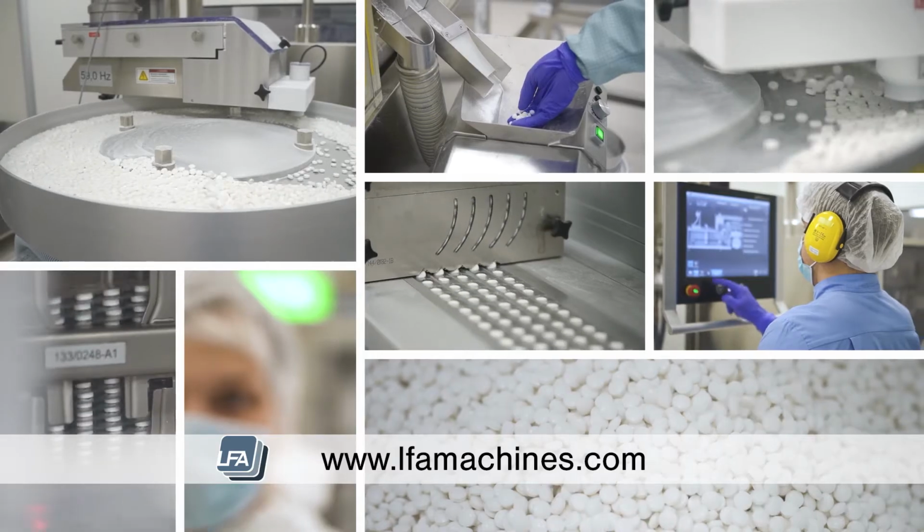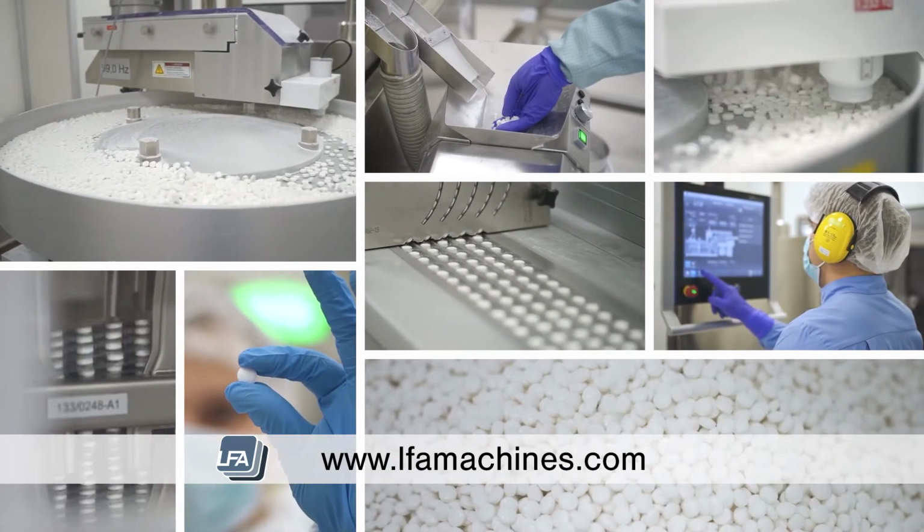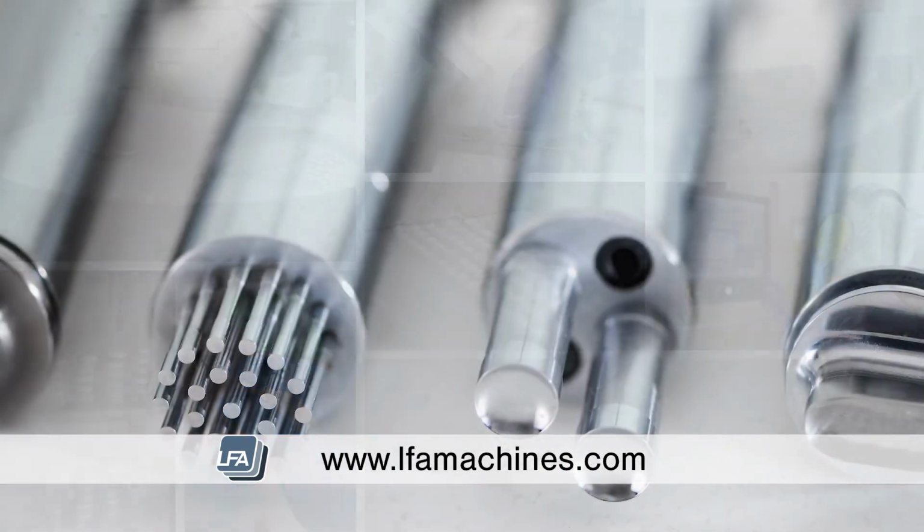It should be mentioned that tableting can be costly. Whilst it's an investment, you need to consider machine wear and tear and replacing your tooling.